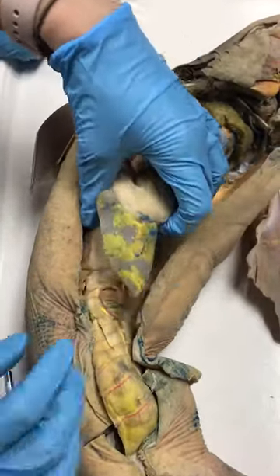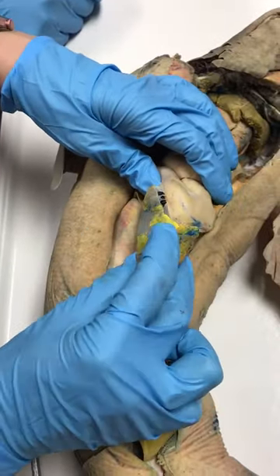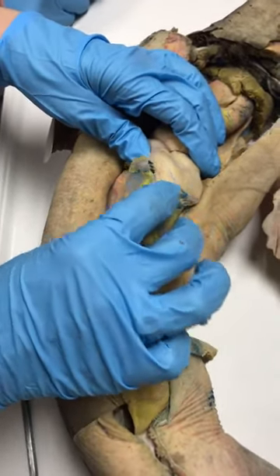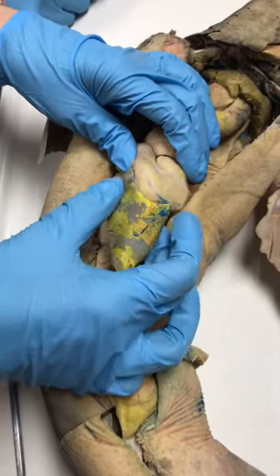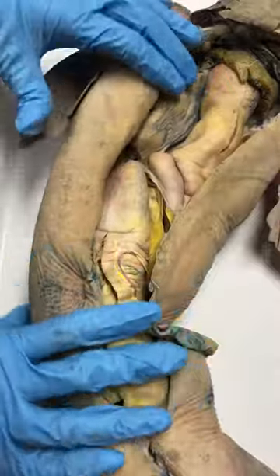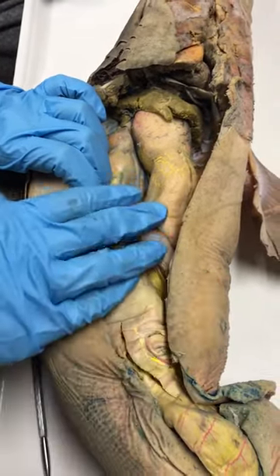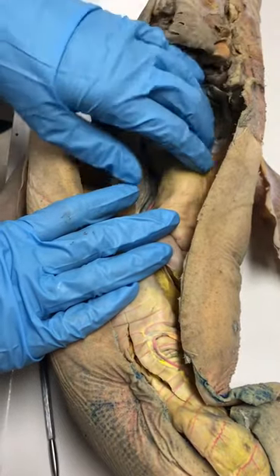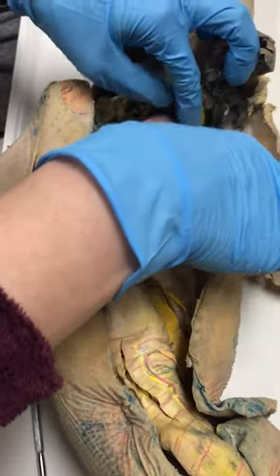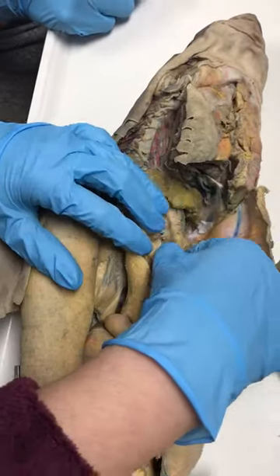The spleen is down here. You can see the yellow material that's been injected. The distinction between the esophagus and the stomach is internal, so this whole part here has been cut open.